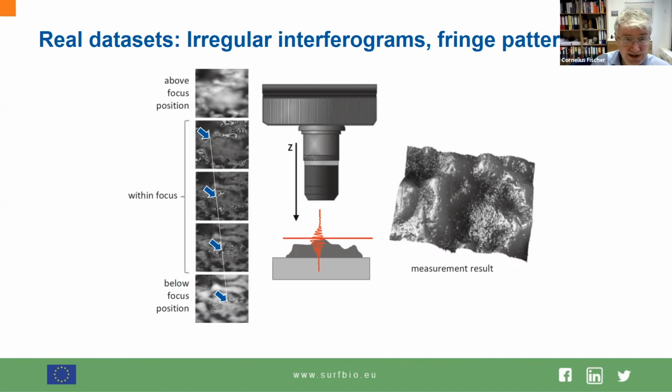It's not just a simple camera, but it's shown here for illustration, but the principle is quite simple. What is done here on the left side is just to store the live images of the interference patterns. It's not the analysis later on for reconstruction of a sequence of interference patterns and to calculate the height distribution from one fringe to the other. Here it's just a sequence of live images. And the interference pattern looks quite complex.